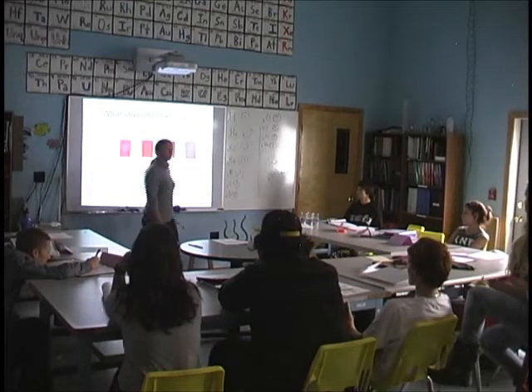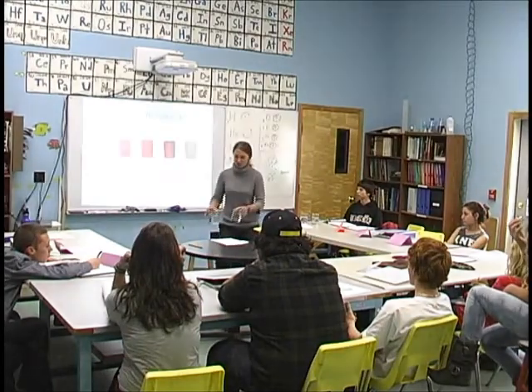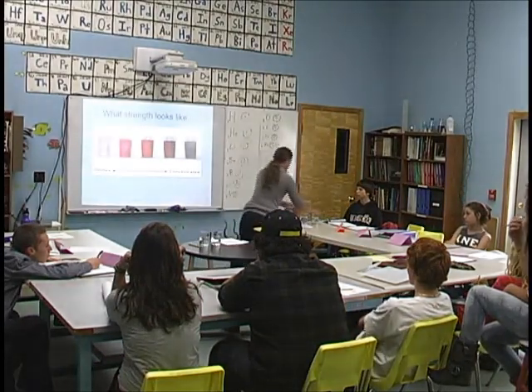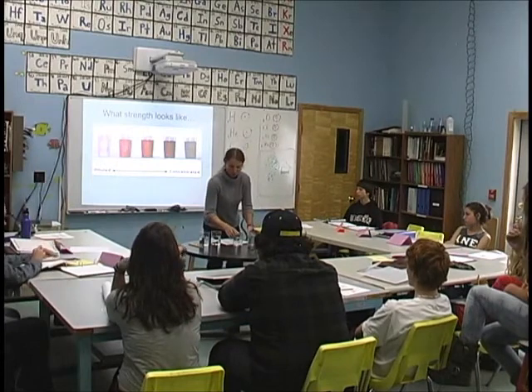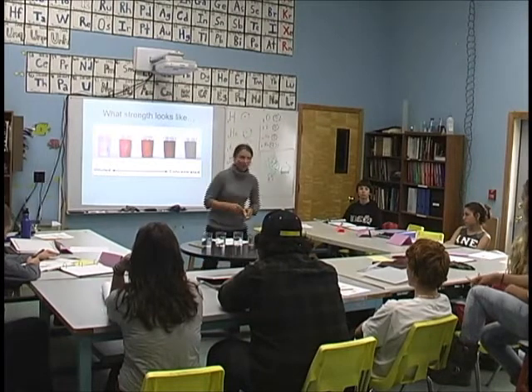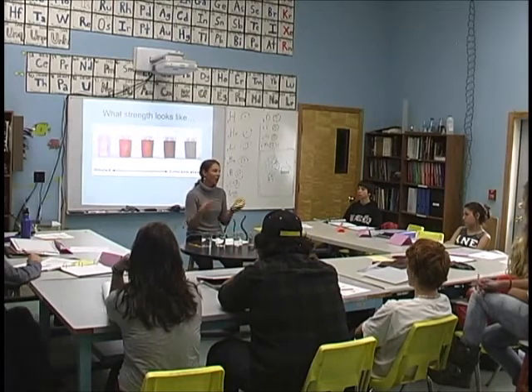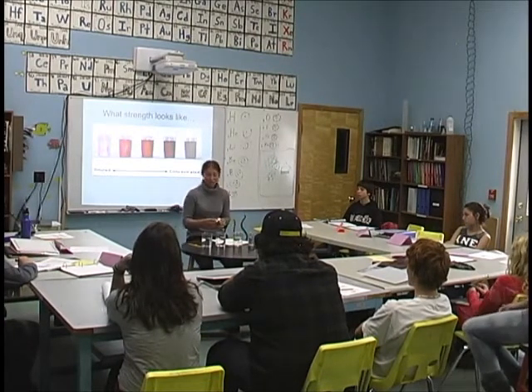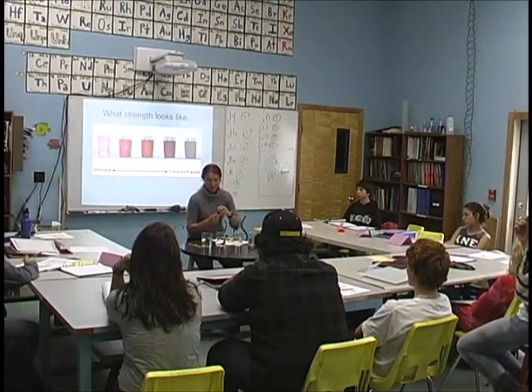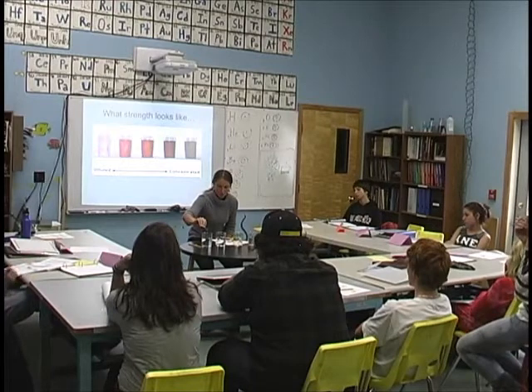Okay, so can we get the lights back on for a minute? This is a sort of visual demo, something to think about in terms of concentration. Back there we have these different acids at different concentrations, and you figured that out by putting coral in it and seeing how it reacted. But in terms of visual, you can have the same amount of drops. So 3, 4, 5, 6, 7, 8.